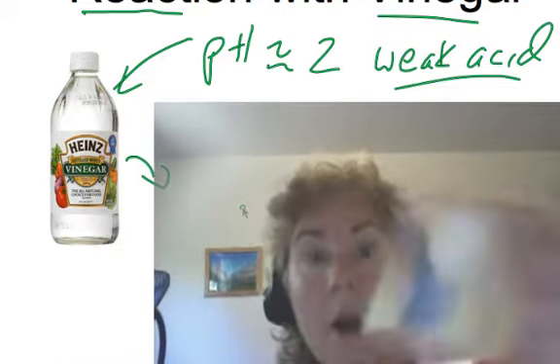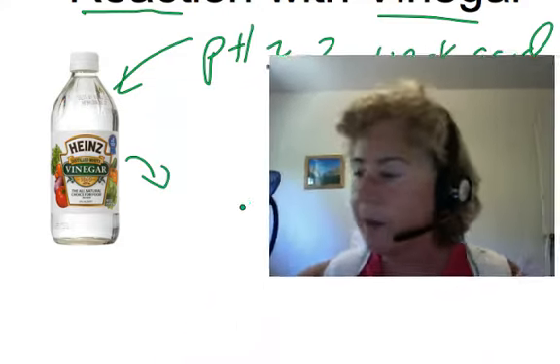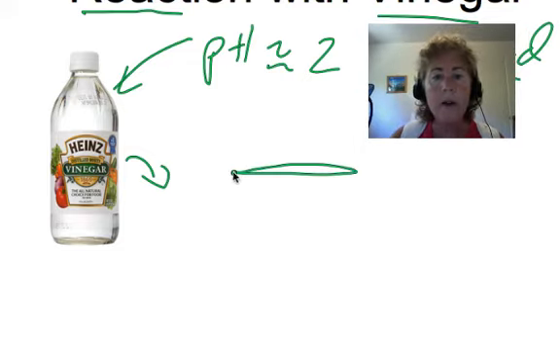It's 100 ml. Wash it out really well after each time. Don't forget, you also have your goggles on. And so we're going to use a beaker. We're going to add a little bit of the powder.